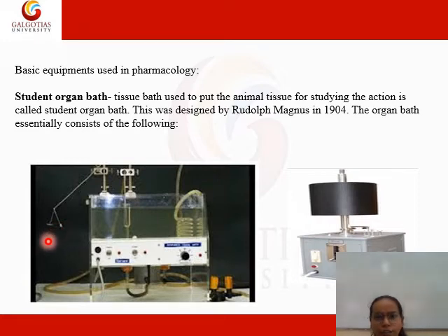Frontal writing lever: this lever is designed in such a way that the writing point rotates freely about its axis. The contractions are recorded as straight lines. Starling heart lever: this lever is used to record the contraction of the heart. Brodie's lever is a general utility lever.